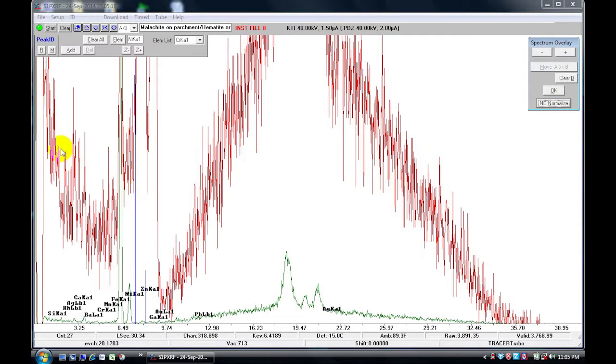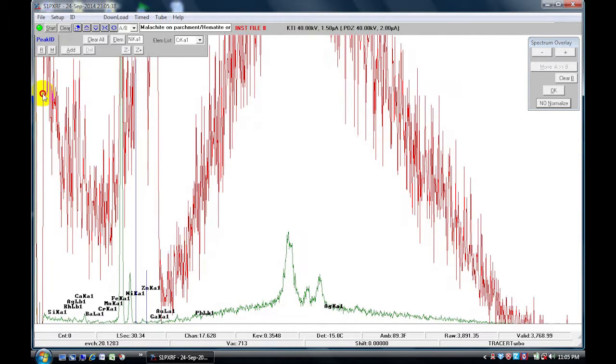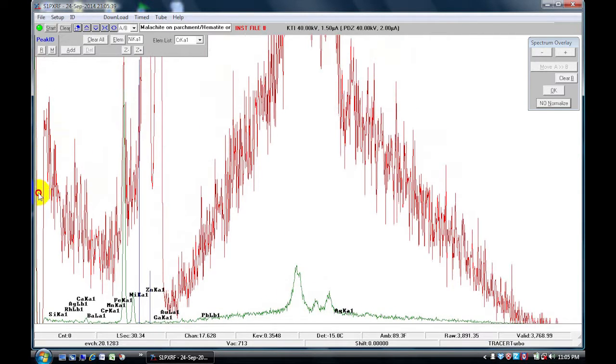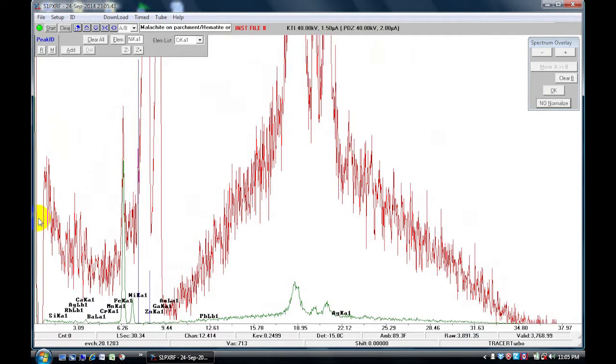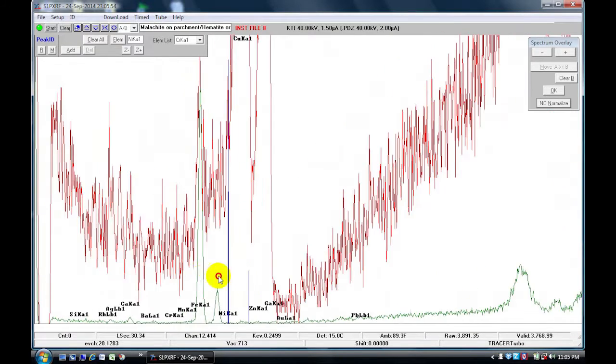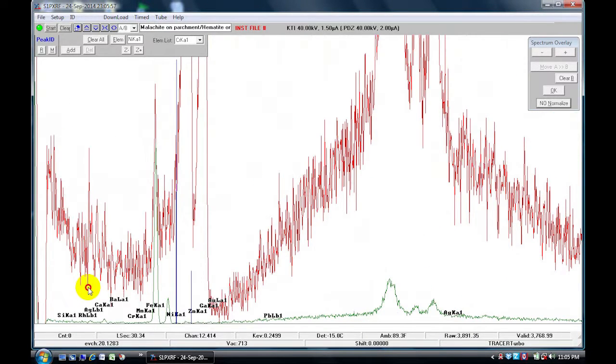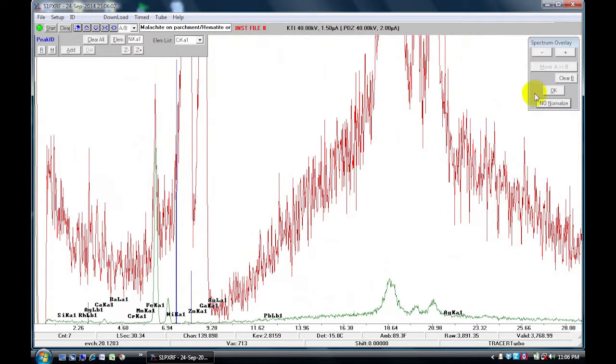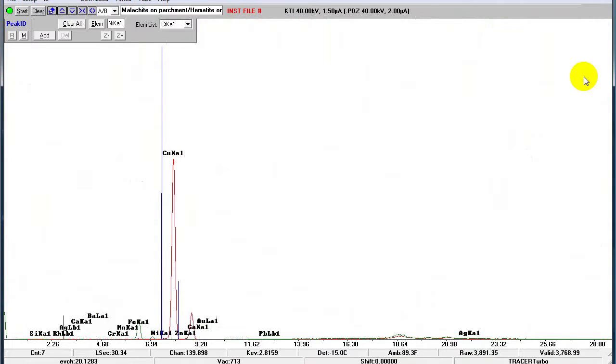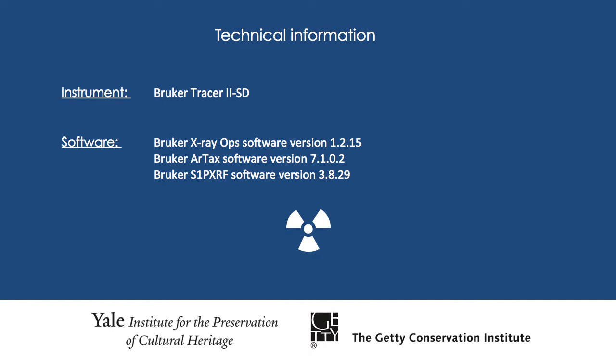Now to compress or to expand your scale, you go to the left side or the bottom, depending on the y-axis or the x-axis. And then you click on the left-hand button of the mouse and then scroll up or scroll down to expand or compress, respectively. And same thing with the x-axis. Click on the left-hand mouse button and then scroll outwards or left or right to compress and expand.